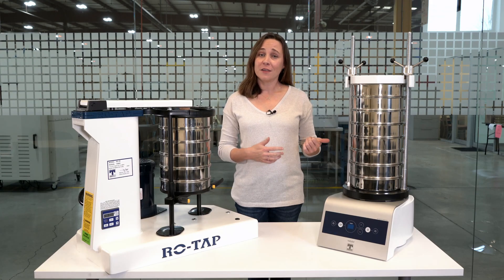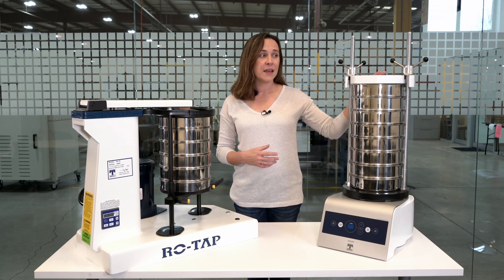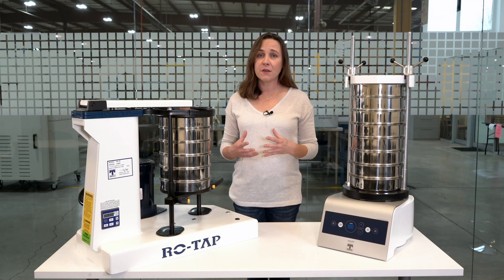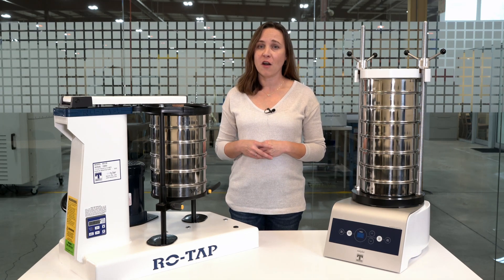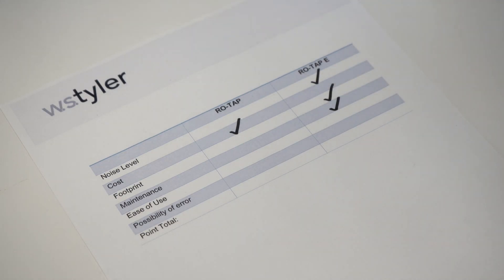The ROTAP-E requires little to no maintenance — you just want to make sure that you keep the support rods clean and be careful of the cover, as it does have some wear and tear parts that are fairly easy to replace. The mechanical ROTAP does require more upkeep; we have videos and articles to help you repair and maintain it, all on our Learning Center. Because of the level of maintenance required, we'll give this category to the ROTAP-E.